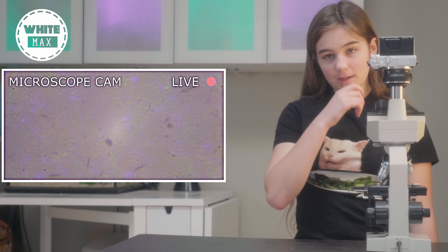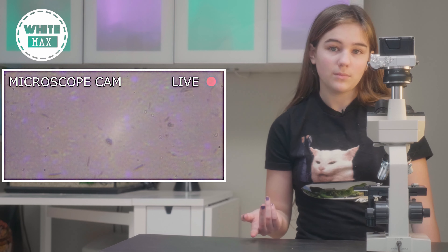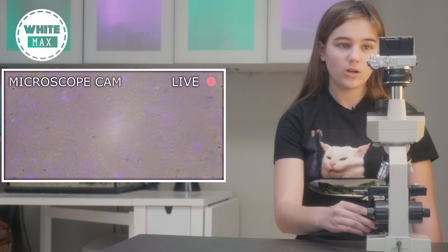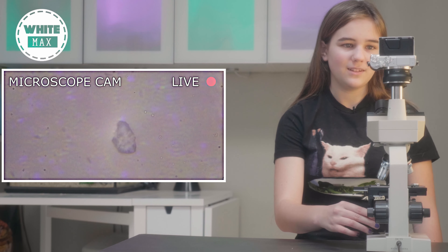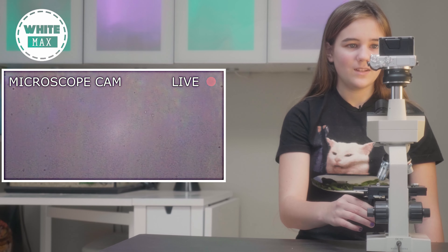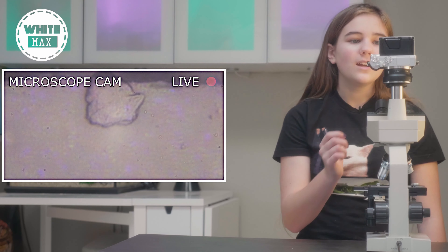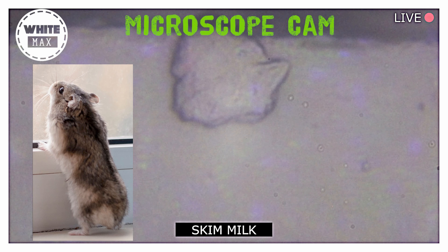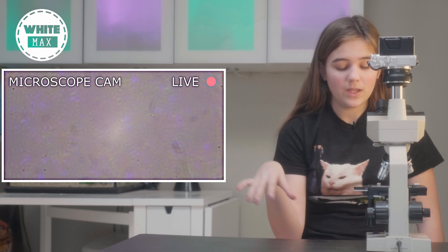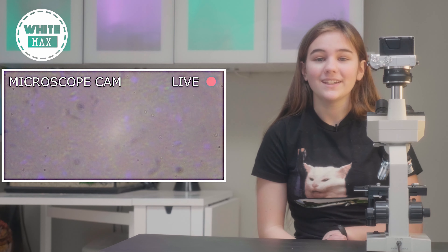I just wanted to say that maybe since this is skim milk — because we only buy skim milk — maybe when you buy 2% milk or 3% milk or cream, it'll probably be thicker, and then you can probably see more of this stuff. And then this looks like an avocado. A little avocado. And there's the side of the slide with a little ball here that kind of looks like a hamster sitting, and it's like really fat. But it looks honestly the same all the way through, and sometimes you find some bubbles or something. That's what milk looks like under the microscope.